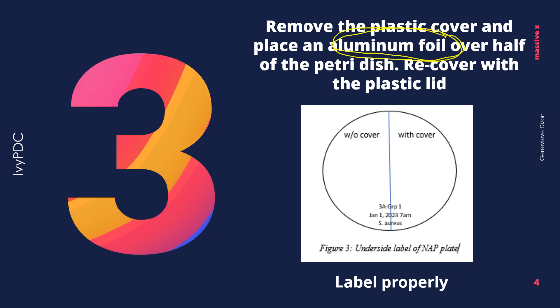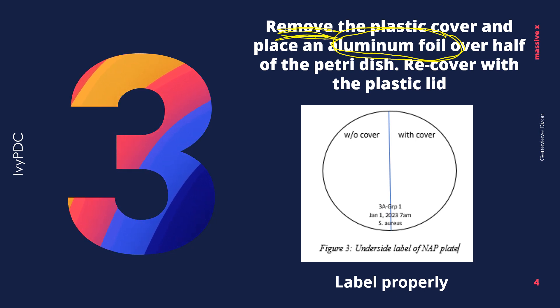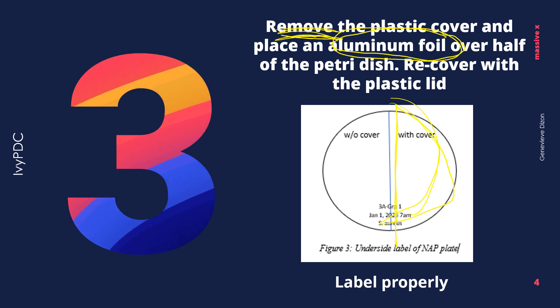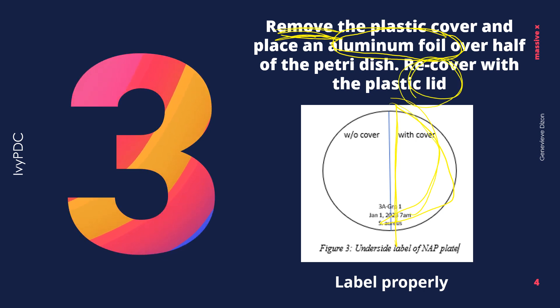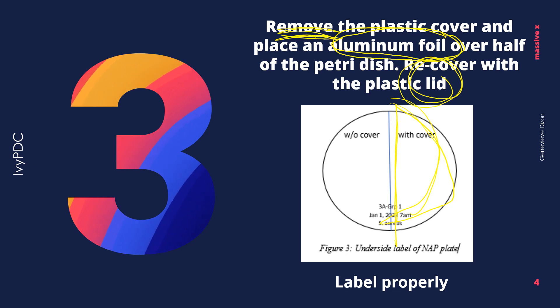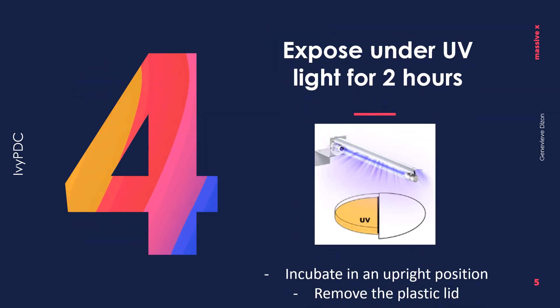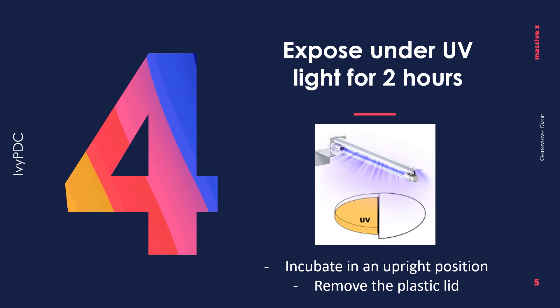Step three is the addition of the aluminum foil. Before you put the aluminum foil, remove the plastic lid of the petri dish, and then place the aluminum foil over half of the petri dish, and then cover the petri dish again with the plastic lid.